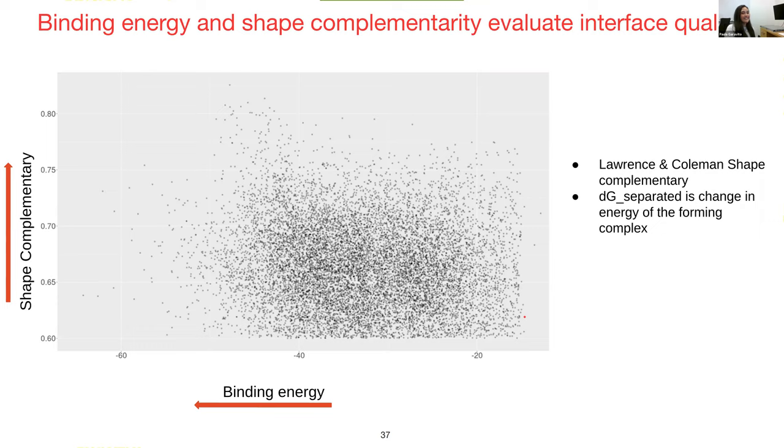And the nice thing about the yeast assay is it's really easy for you to just make designs starting from, like, now you could make 12,000 designs starting from your two starting models and test those in the same way. So that makes it really nice to start working your way up if that's necessary. Of course, you don't know if it's even necessary.